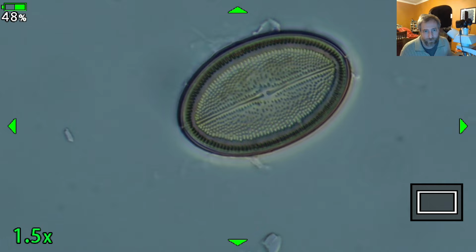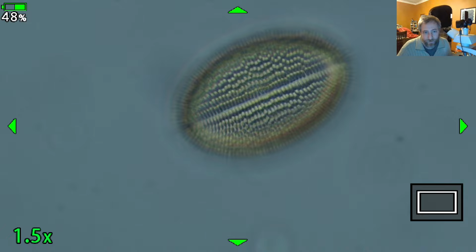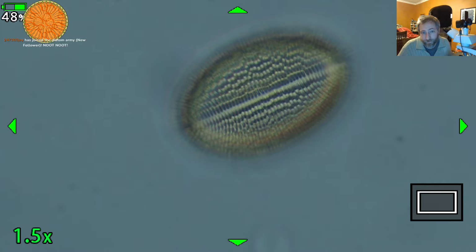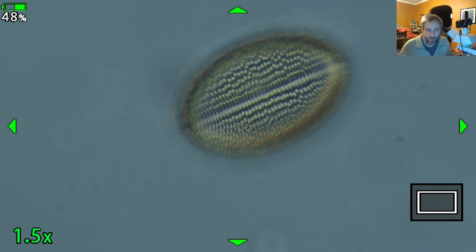But if we use the microscope, we can actually focus through the diatom and then we can see what's on the other side, which is kind of nice. I'm sure you've seen an MRI or something where they can see through things. But we can actually see through diatoms because light microscopes use transmitted light. And so if we set the focal height at a different place, we can actually see what's on the other side of the diatom. And in this case, we can see that here's the valve on the other side. It actually looks very different on the back side. There are two totally different sizes and shapes to the structures on the valve.